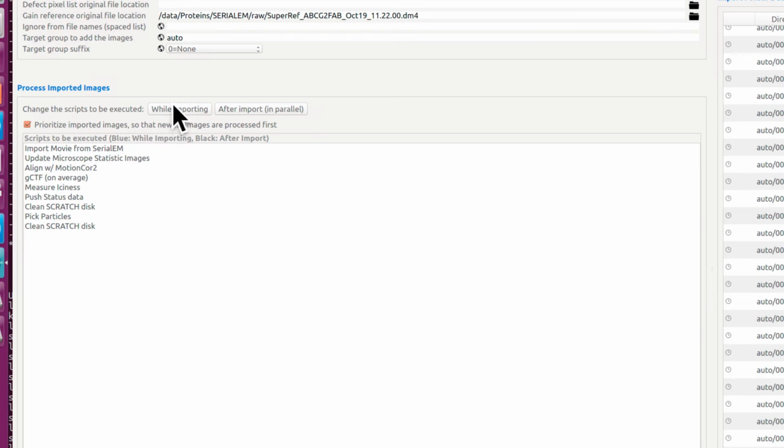You could have scripts run while importing, and this only makes sense for one single purpose, which is when you run in tomography and you want to have a script that imports in the Hagen scheme movies that are all from the same sample, same pore bacteria in tomography or so, but at different tilt angles, and then each script needs to learn the current electron dose on the sample and has to learn also the prior electron dose on the sample from the previous movies on this sample in this tilt series.